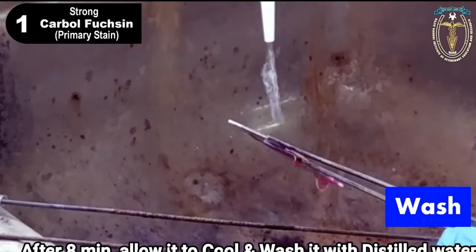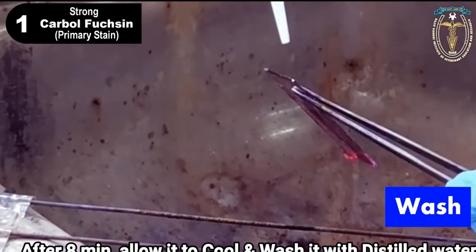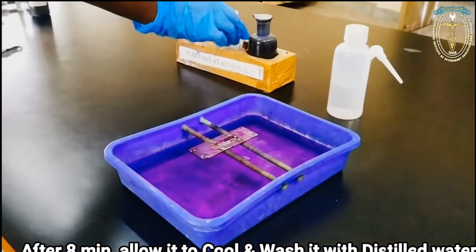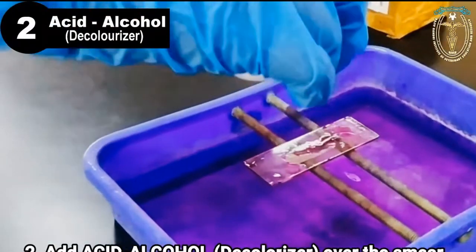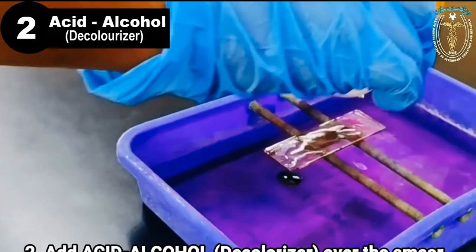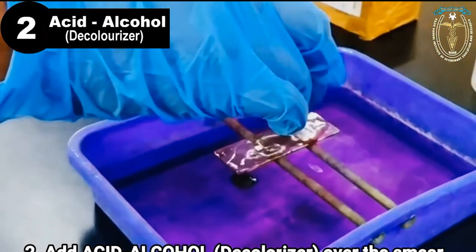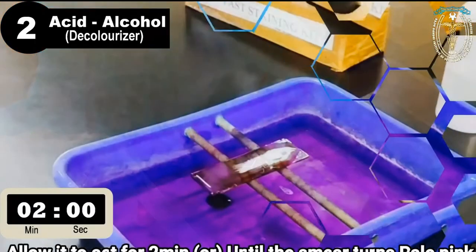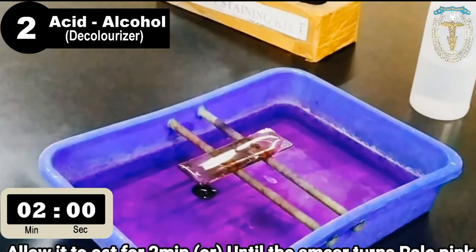Secondly, add the acid alcohol, the decolorizer, over the smear. Cover the entire smear with the acid alcohol, and allow it to act for 2 minutes or until the smear is sufficiently decolorized to pale pink. After 2 minutes, wash it with the distilled water.